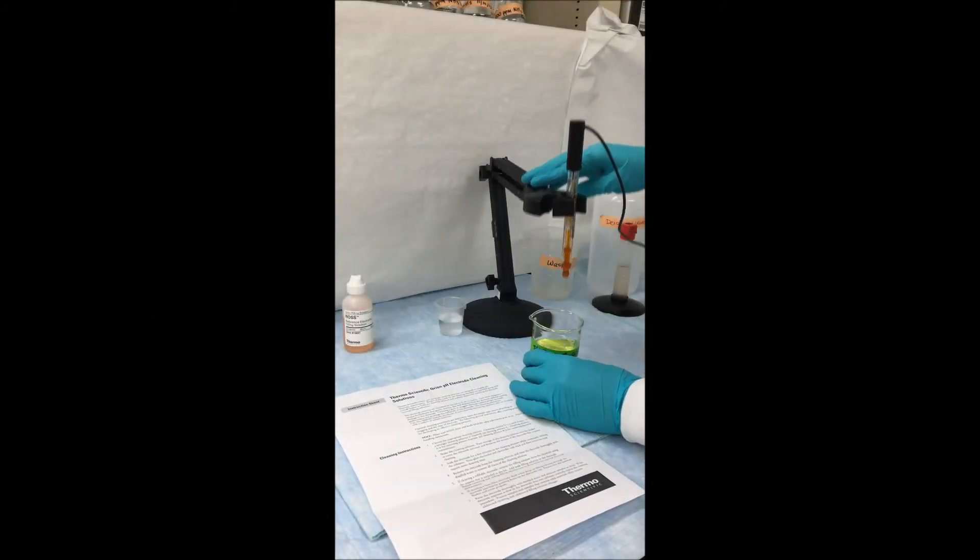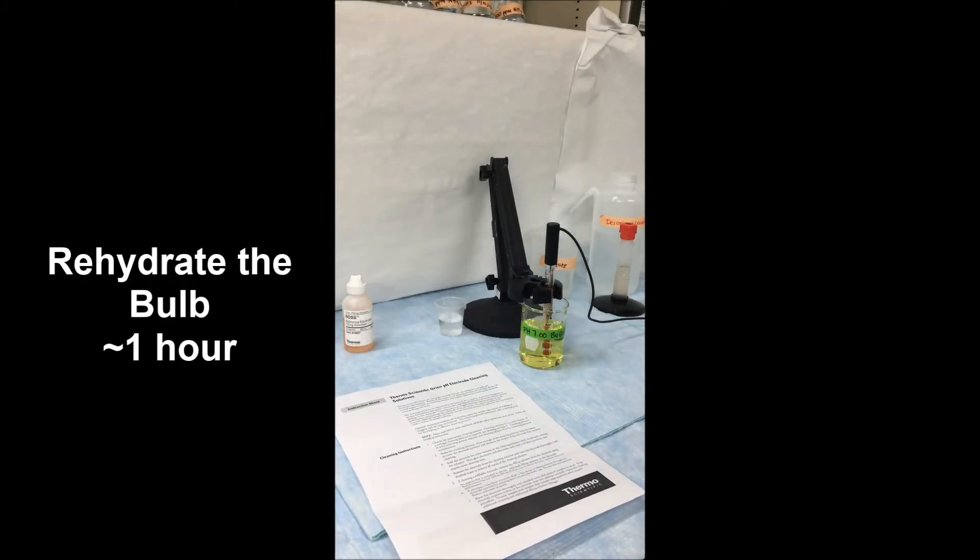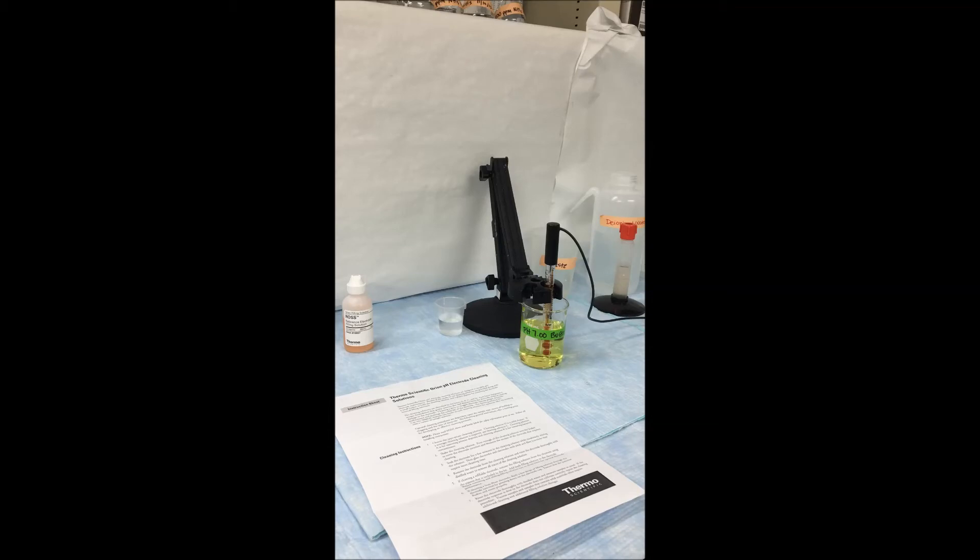After you clean your electrode, you want to rehydrate the bulb. You want to let it sit in a pH 7 buffer for about an hour, or even better, let it rest in storage solution overnight.